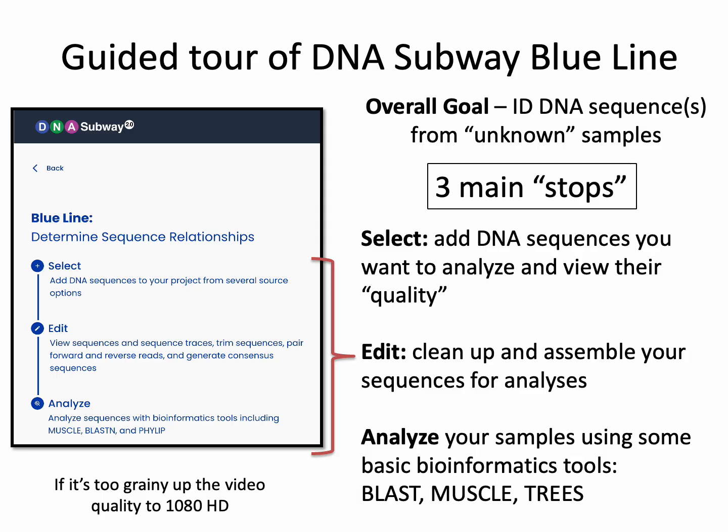Please follow the directions in this video to analyze the practice set of fungal DNA sequences posted in this week's module. Do your best to follow along in DNA Subway and pause the video to answer the questions that are embedded in the video. This will help prepare you for your in-class analyses of your group's data coming up soon.